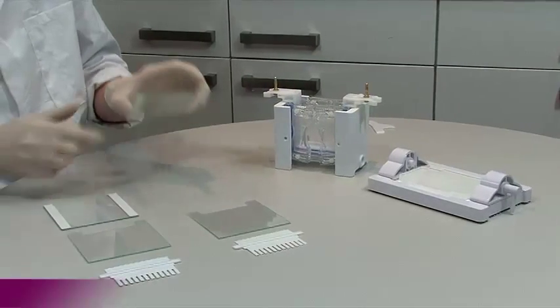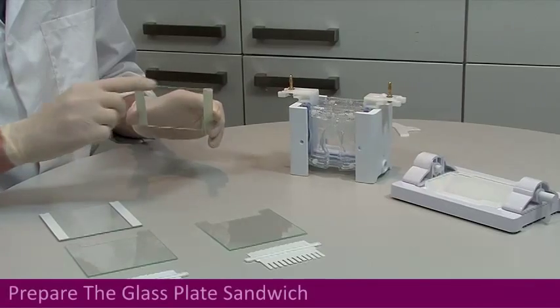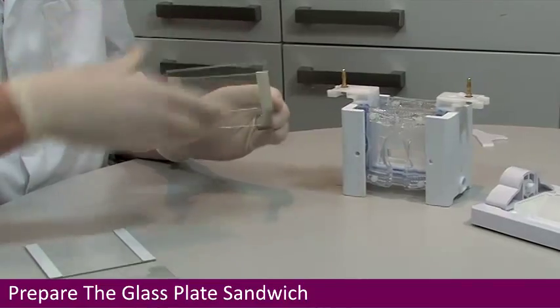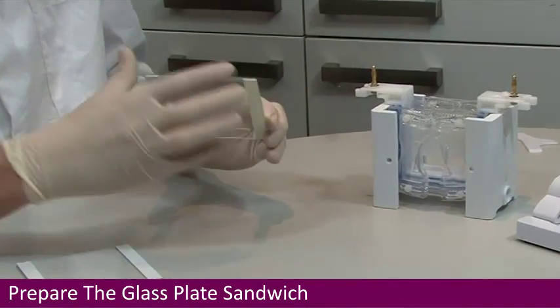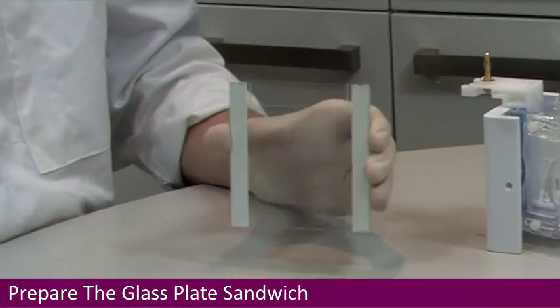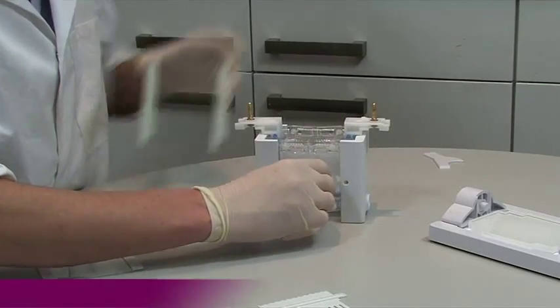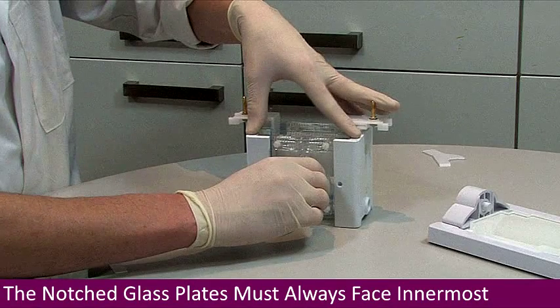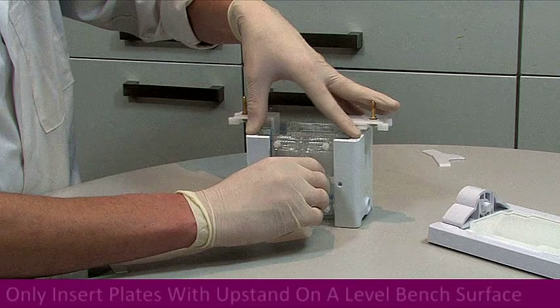Ensure that all components are clean, dry and free of any chips or cracks before making a glass plate sandwich. This is a plain glass plate with bonded spacers, put together with a notched glass plate. With the clamping bar pulled out and the upstand on a flat surface, insert the glass plate sandwich into the upstand so that the glass plates lie flat on the lab bench surface and the tops of the glass plates are level with the tops of the white sides of the upstand.